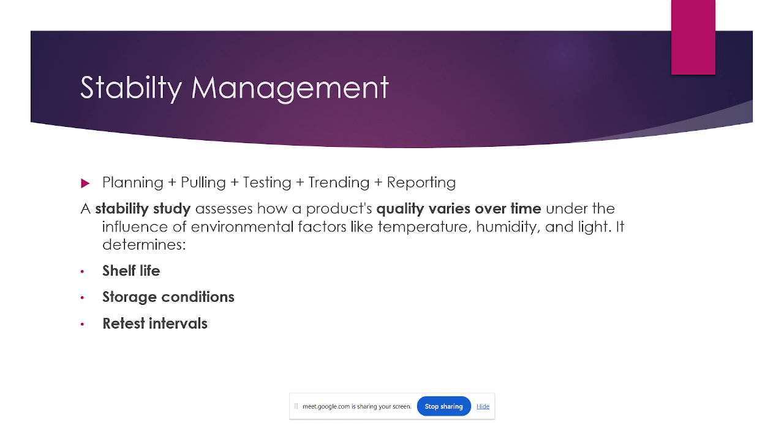First time we are doing these tablets. First time we are manufacturing the tablet. When you are manufacturing for the first time, then you need to load the stability samples also. Why? Because whatever tablets you manufacture, you need to test that batch to see whether the samples are stable or not. So how many months it is stable, under which conditions it is stable, all those things we need to track.